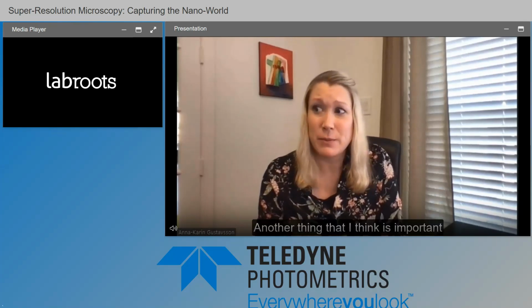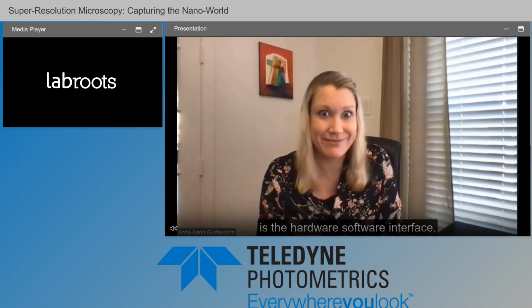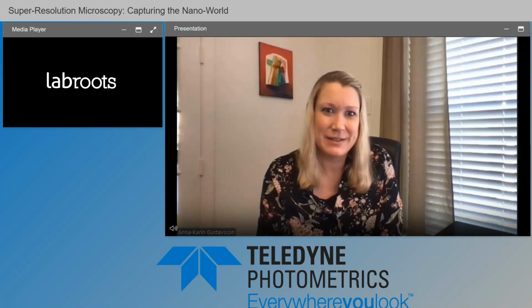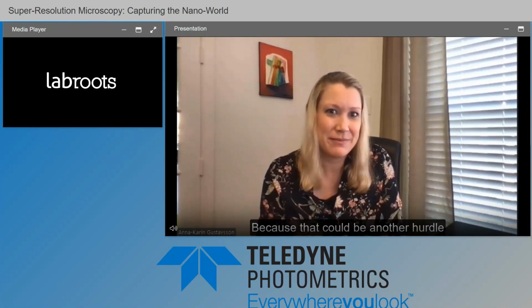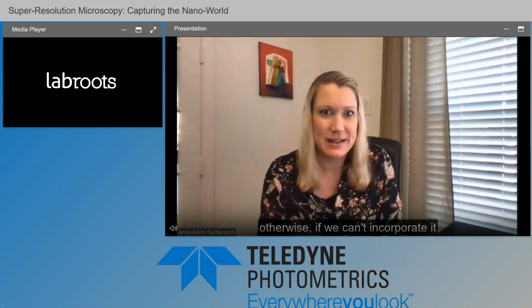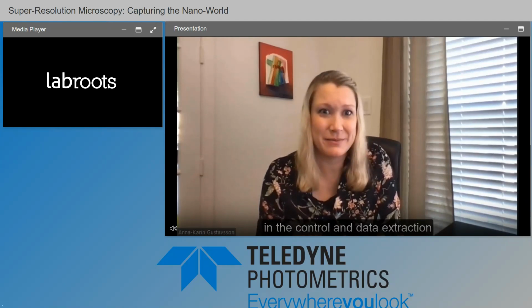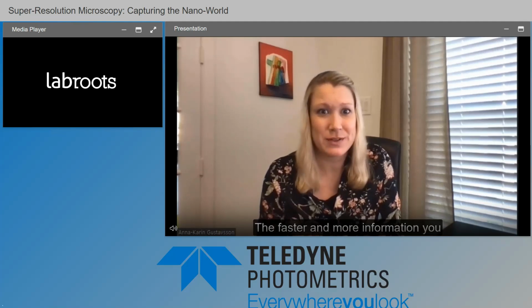Another thing that I think is important is the hardware-software interface. How well can we communicate with the cameras? Because that could be another hurdle otherwise if we can't incorporate it into the rest of the setup, so to say, in the control and data extraction.